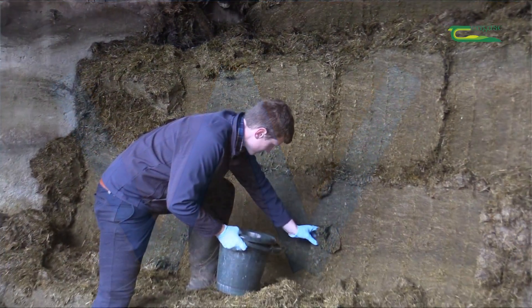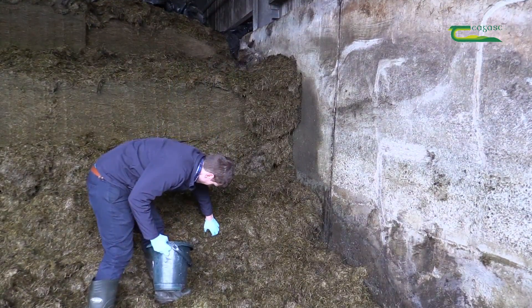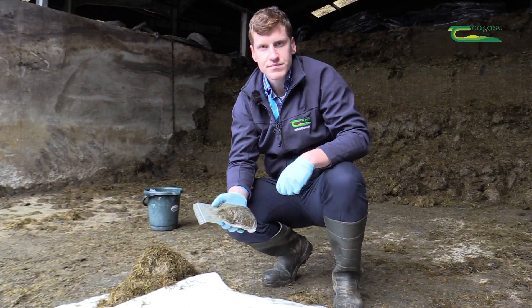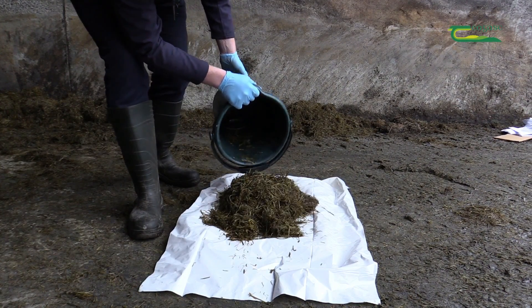A total of 9-15 samples taken along the W ensure that each sample is taken from a different horizontal and vertical position. Preparation of a sample for analysis should include tipping the sample onto a clean surface such as a clean board or worktop to prevent contamination.